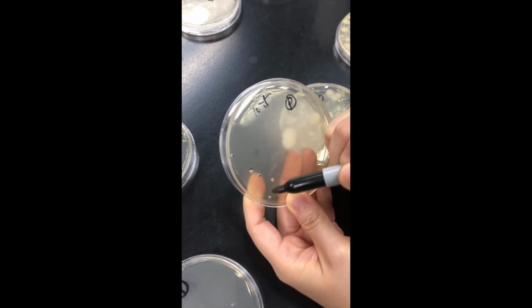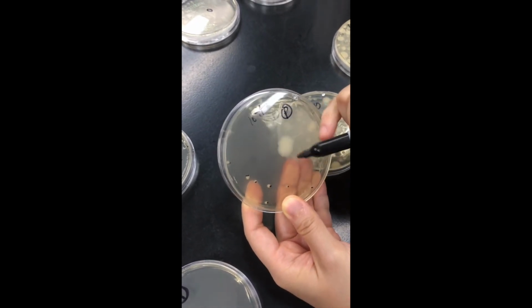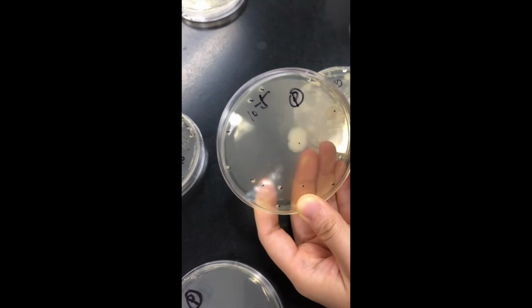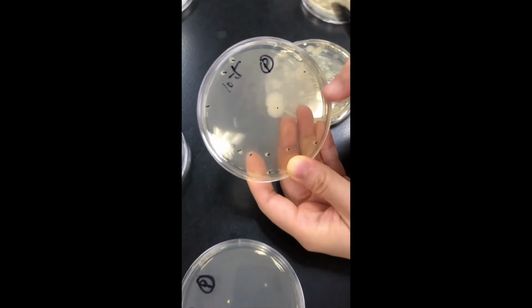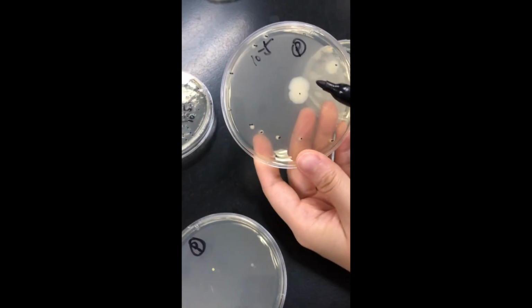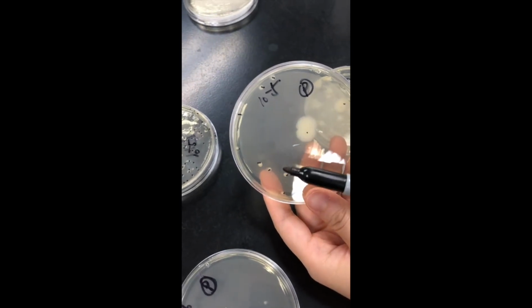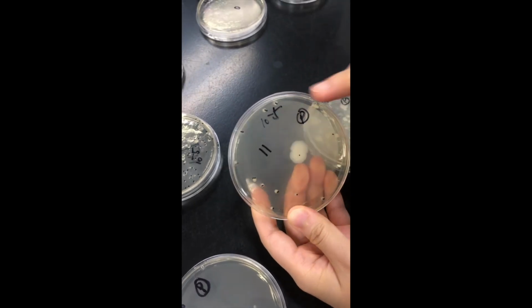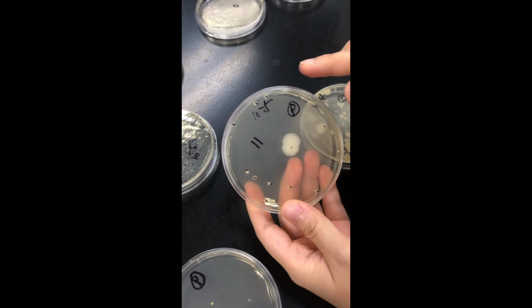1, 2, 3, 4, 5, 6, 7, 8, 9, 10. Even though this is very big, it still shows that different bacteria have different colony shapes. This is only one colony. So we finish counting, it is 11 from our 10 to the minus 5 plate.